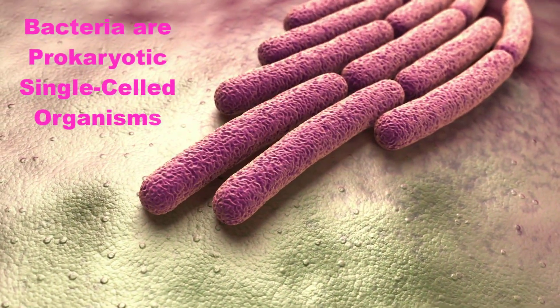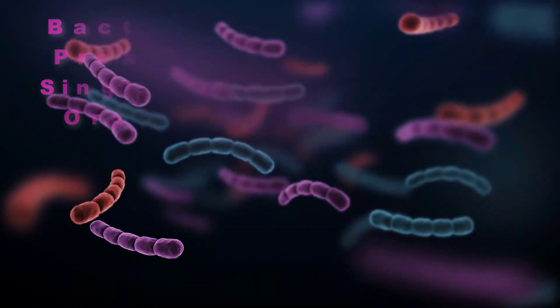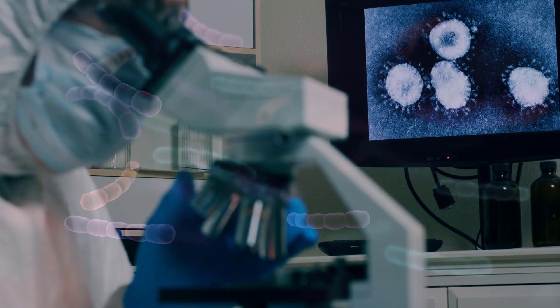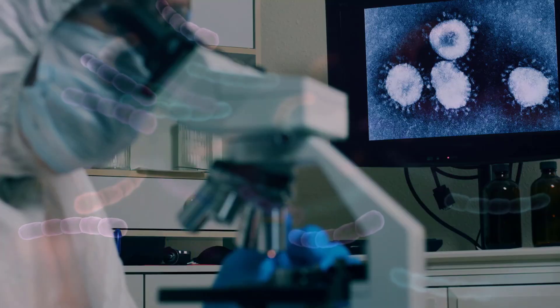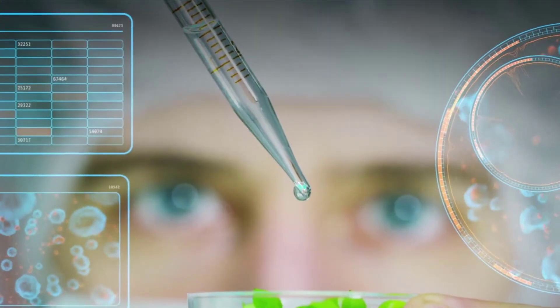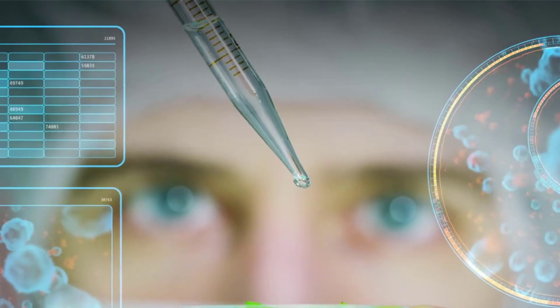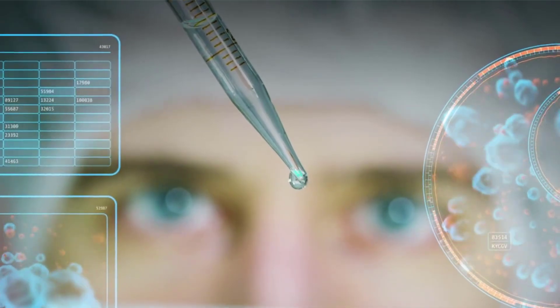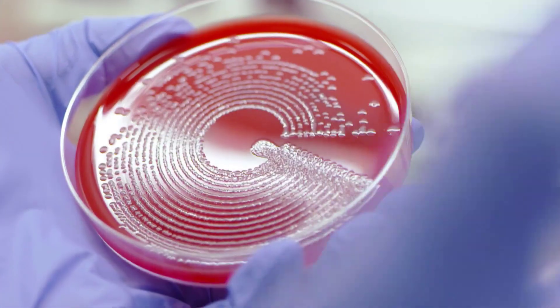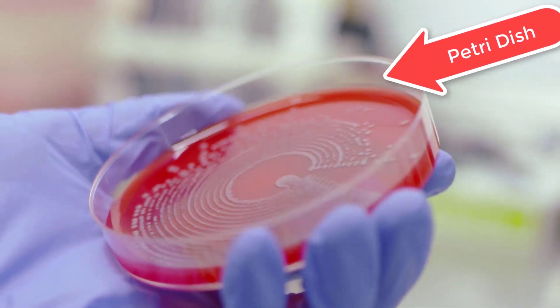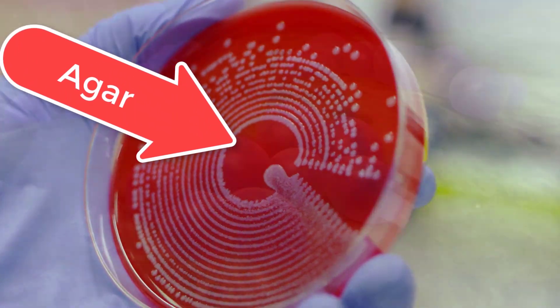Bacteria are prokaryotic single-celled organisms. Individual bacterial cells are visible with the aid of high-powered microscopes. Under proper nutritional and environmental conditions, bacteria can be controlled in a laboratory setting. They are usually cultivated in sterile petri dishes containing a gelatin-like nutrient called agar.